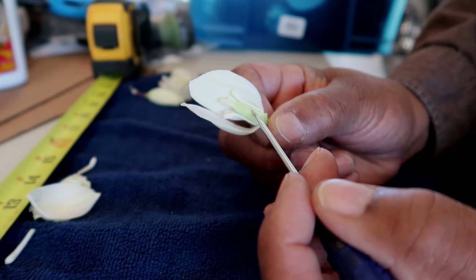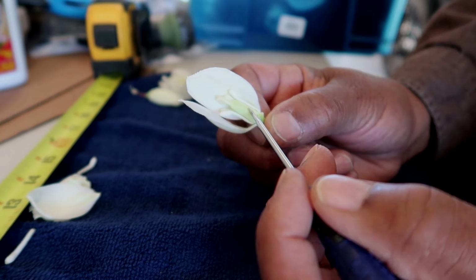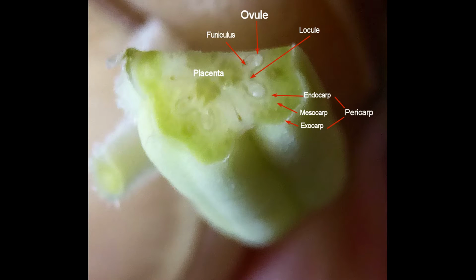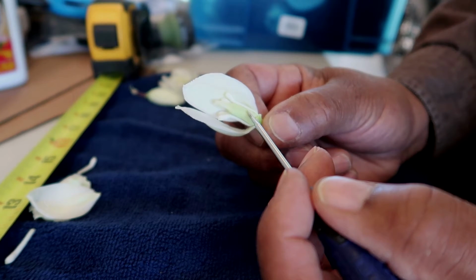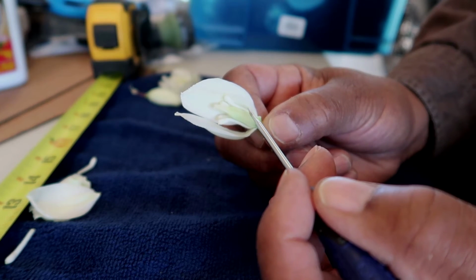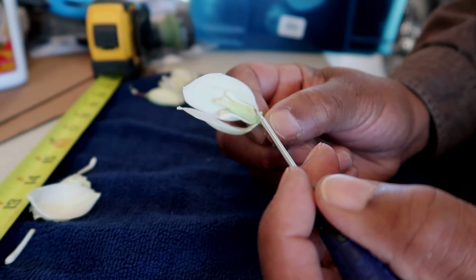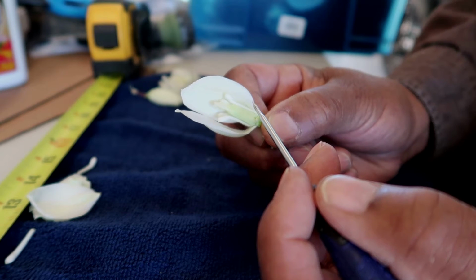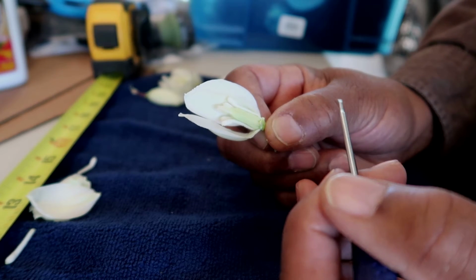Reaches the ovules, which are the unfertilized eggs, fertilizes them, and then seeds form. At the same time, the moth's eggs are already in here too, and they have a safe place to grow, and once they start growing, they derive nourishment from the seeds which are formed by the plant.